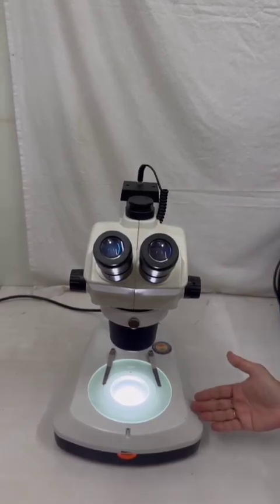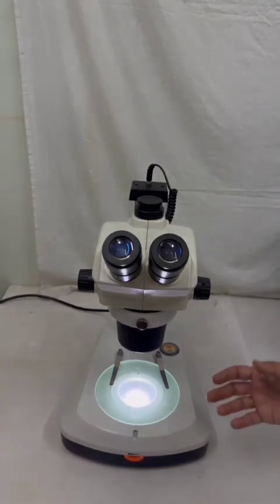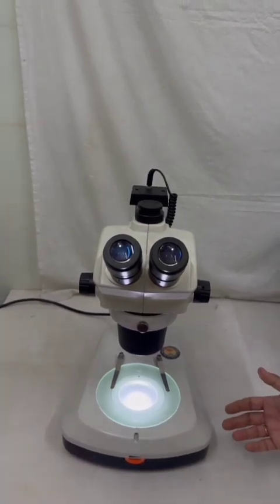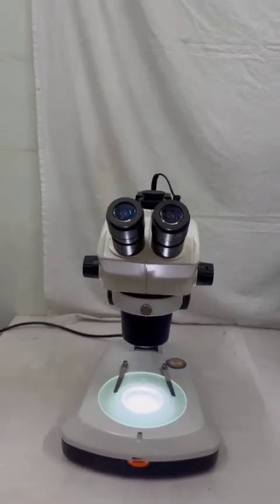This is the stereo microscope. This microscope works on low magnification and it gives us a 3D visualization of the specimen. So it is a very useful tool for research purposes. This was a normally used compound microscope.